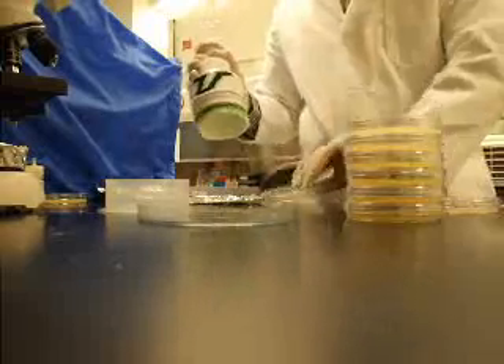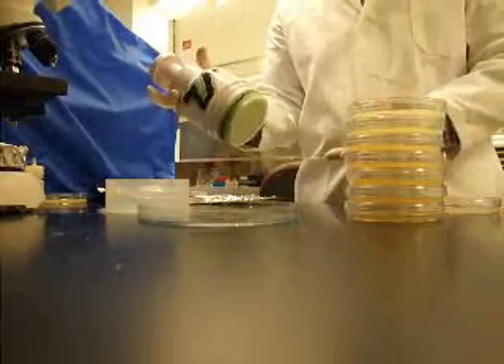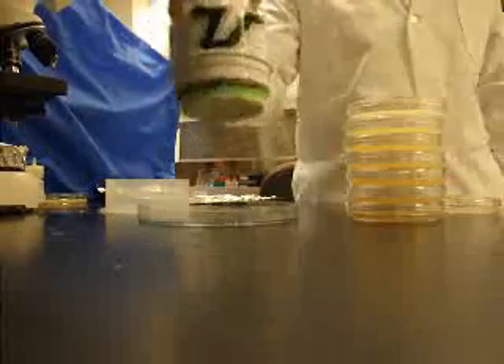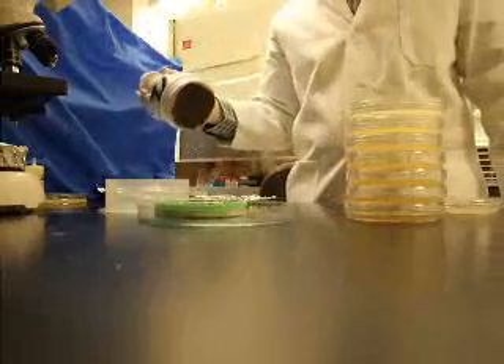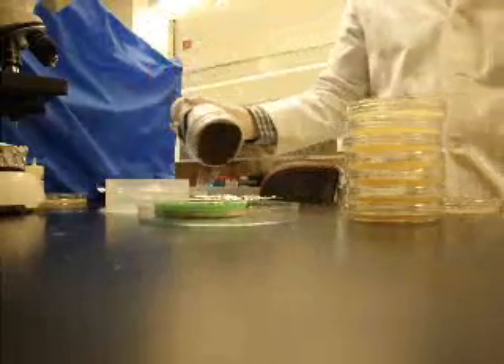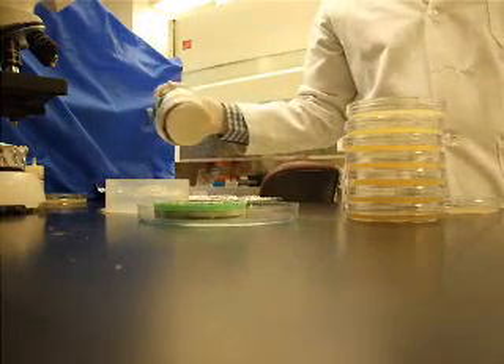Once complete, the waste transfer disk is ready to be treated, sterilized, and reused. It's ejected in a hands-free manner, minimizing risk to the user or cross-contamination. The next disk can then be quickly affixed.